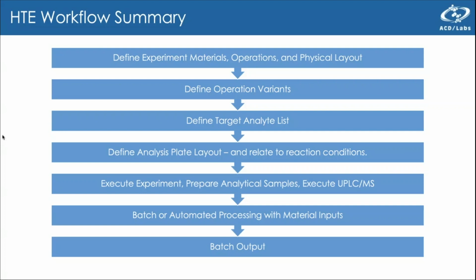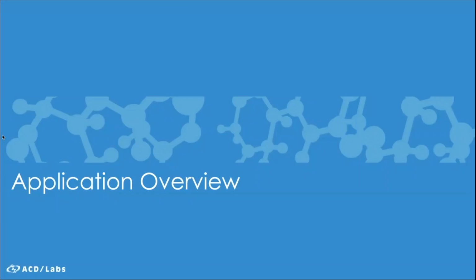So ultimately we can make decisions on, for example, what is the best combined set of conditions that afford the best reaction outcome, as an example.